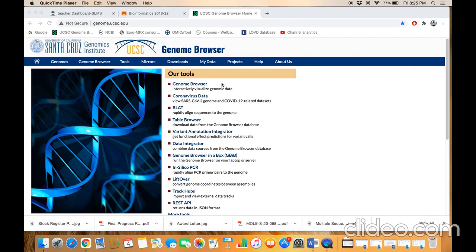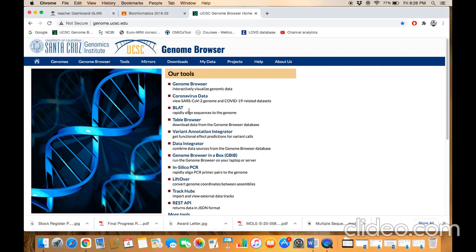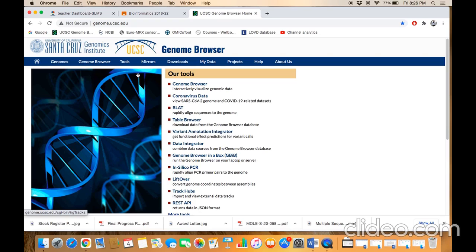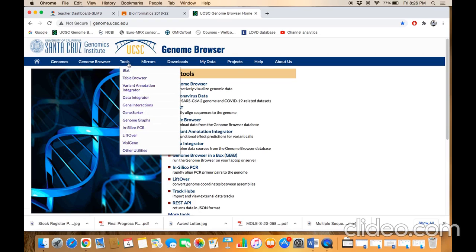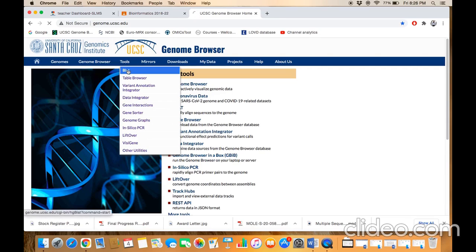You can access the BLAT database and BLAT tool through the most popular resources section, where you can find BLAT. Alternatively, you can also access the BLAT tool via the Tools menu bar. You need to scroll on Tools and then click on BLAT.